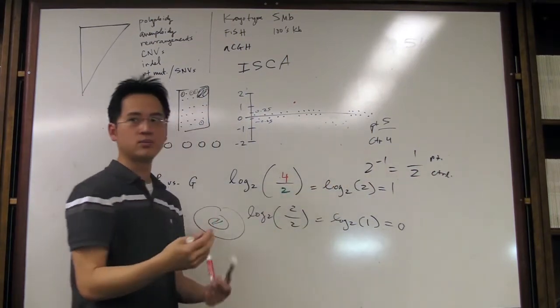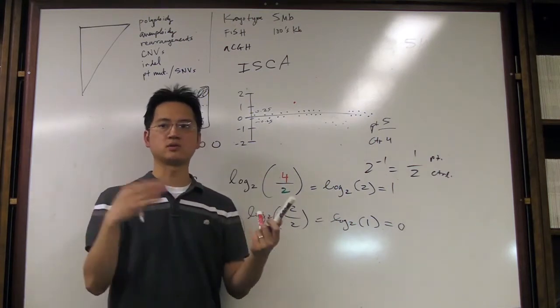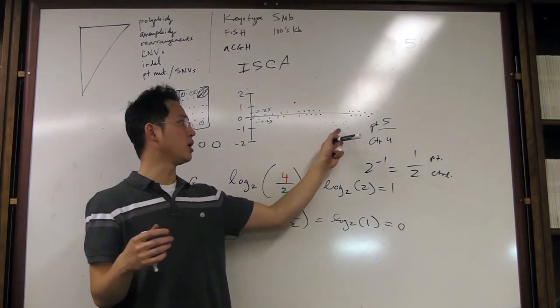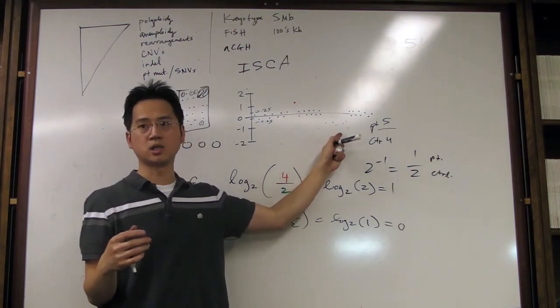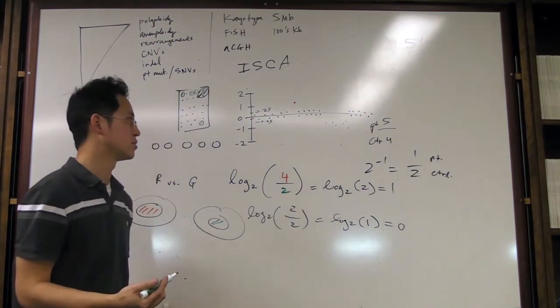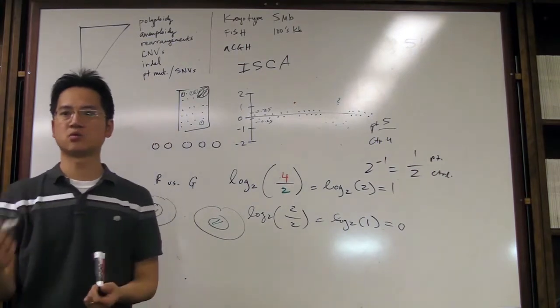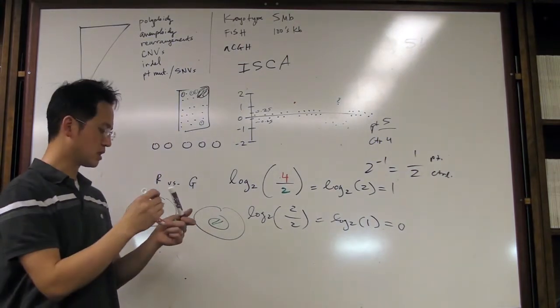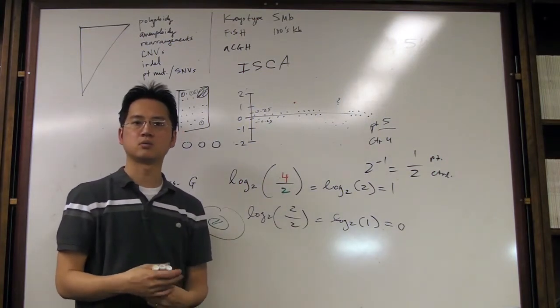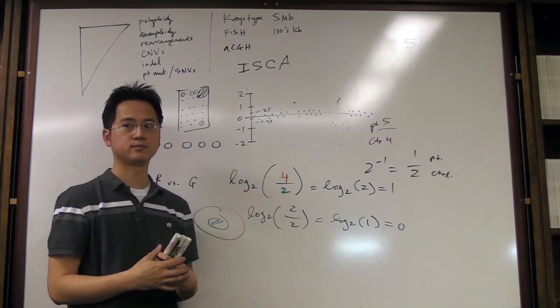If you were to calculate the p-value, the chance of this happening, depending on the noise and how things are distributed on your array, is highly significant. So this is the minimum number of probes that we would be required to call a change on our array or on our assay. And the next question is, what is being changed? So you want to ask, what is the gene that's involved? What is the region that's involved? Has it been associated with disease or not? And that's how you make a call in terms of the array CGH experiment or assay.